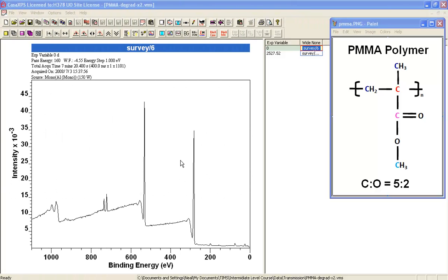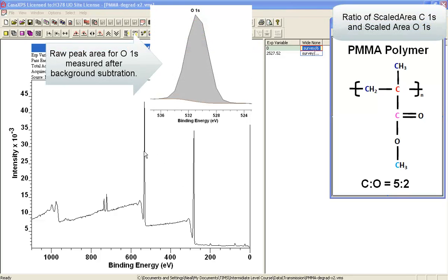These data are acquired from polymethyl methacrylate. If we look at the expression for polymethyl methacrylate, the number of carbon and oxygen can be established by counting the atoms and their relationship within the molecule in order to work out what the ratio of the carbon-1s peak should be compared to the oxygen-1s peak.